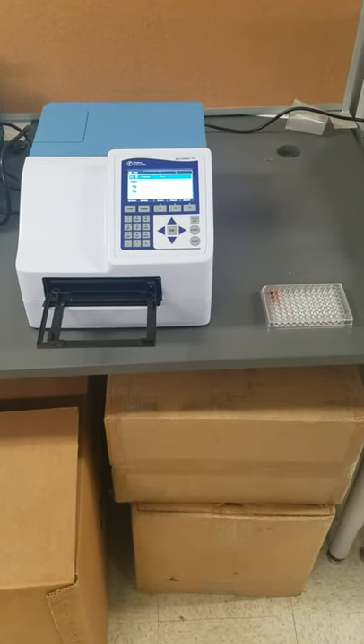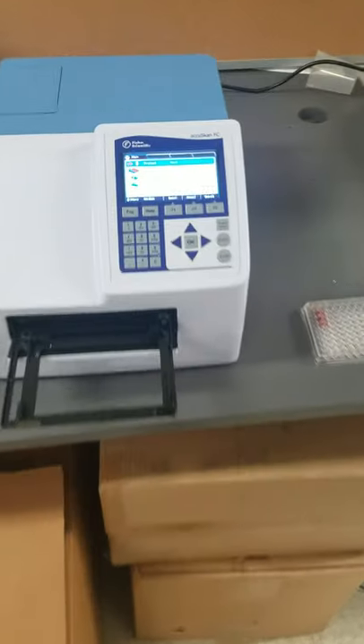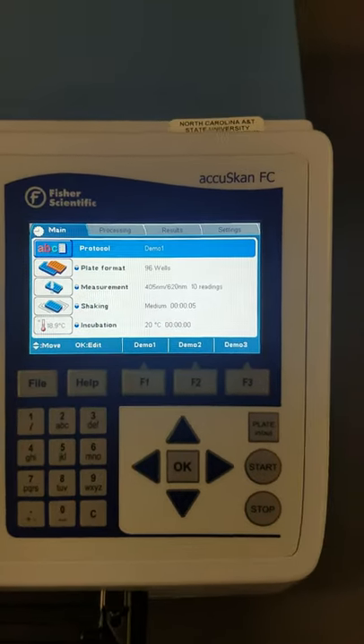Hi. Today we're going to do a quick rundown of how to load a plate into the Fisher Scientific AccuScan FC.